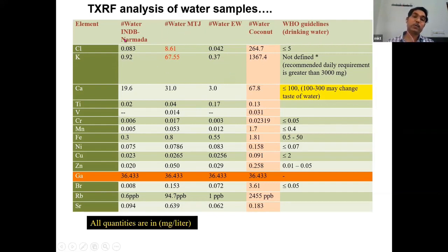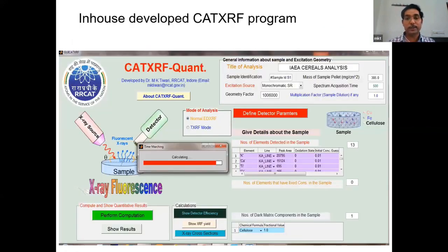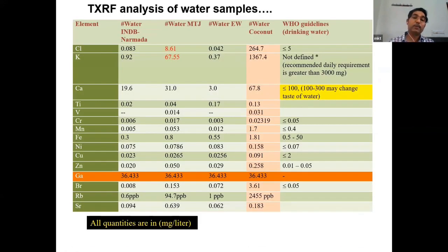So why is this water similar? Because we use groundwater and then treat it with the RO filter, and the concentration of potassium increased. The reason is that sometimes the RO manufacturers use some chemical ingredient for the ion exchange method. So basically calcium ions are converted, and potassium ions increase, just to maintain the different compositions. But this is not good.